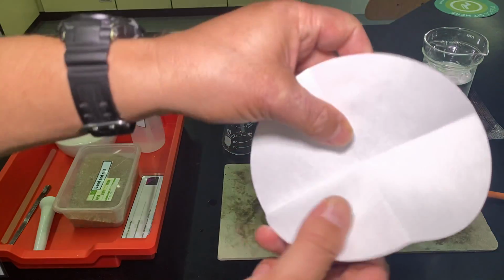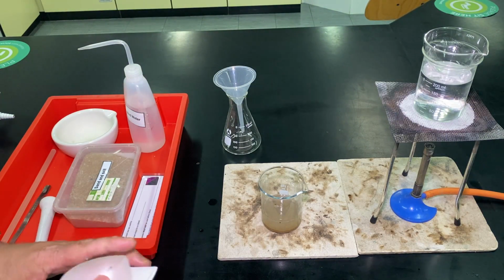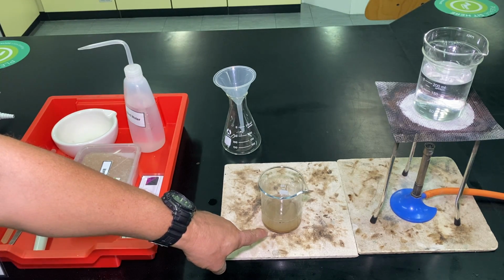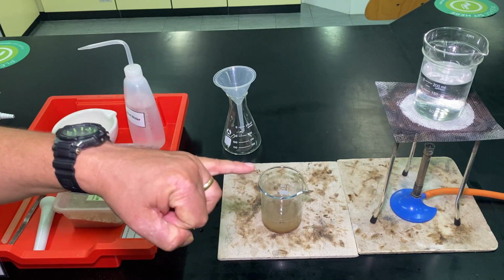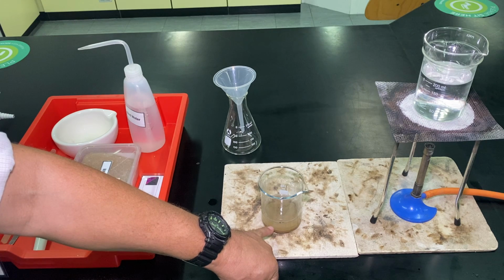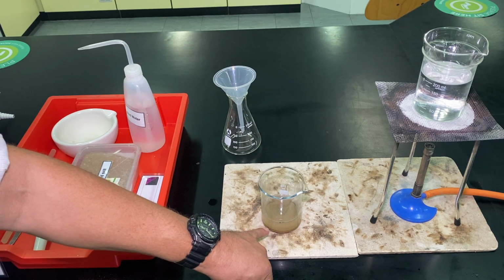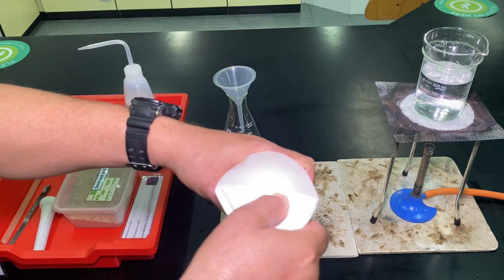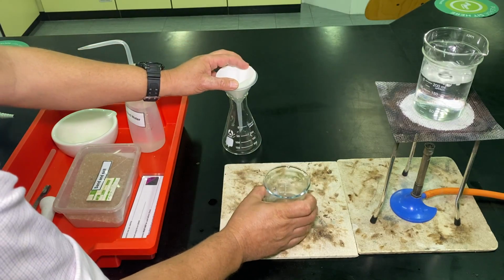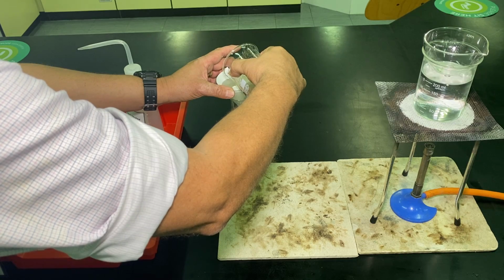So for filtration, we're going to use a piece of filter paper here. Filtration is a way of separating insoluble sand from the salt solution. So in here now we have a solution of sodium chloride, the salt dissolved in the distilled water. That will pass through the filter paper, but it will collect the large particles of sand, and that goes in there like that.